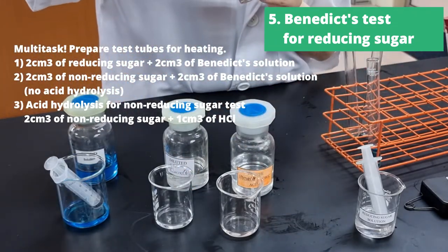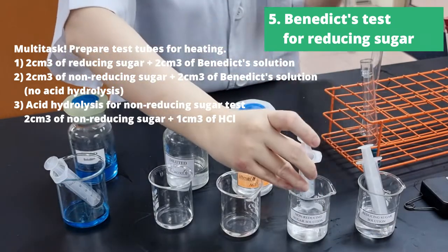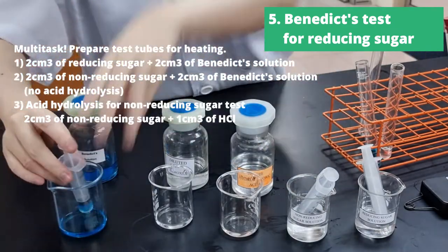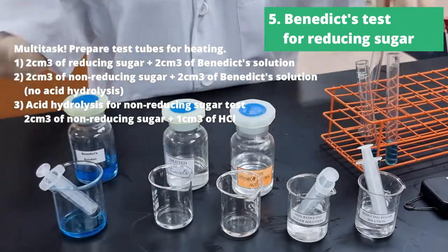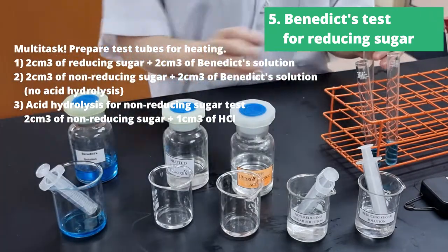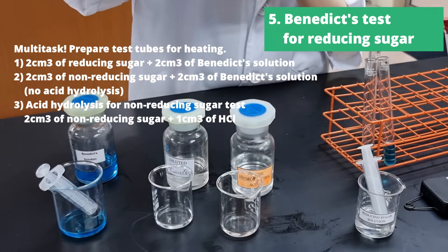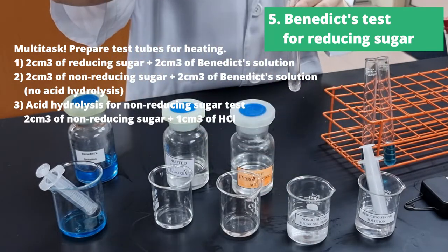So we're going to prepare three different test tubes. Number one, we'll be adding 2cm³ of Benedict's solution to 2cm³ of reducing sugar. Number two, we'll be adding 2cm³ of Benedict's solution to 2cm³ of non-reducing sugar — this is without acid hydrolysis, so we would expect a negative result for this second test tube.